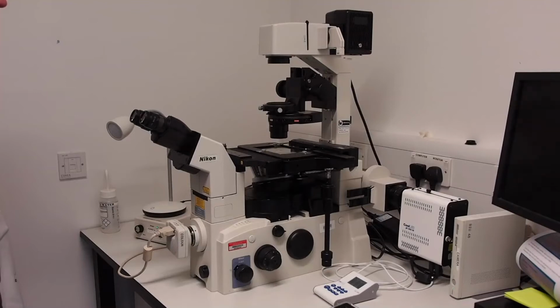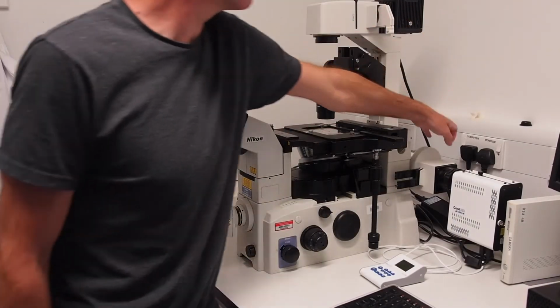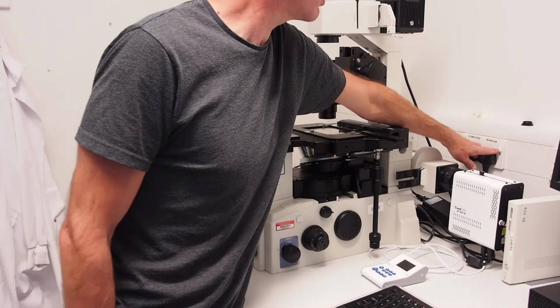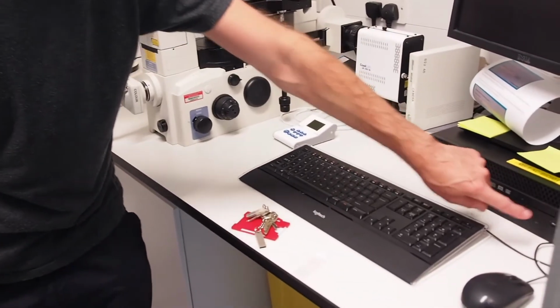In order to turn on the Nikon TE2000 microscope system, firstly turn on all of the components using the switches on the wall for the system, along with the computer and monitor. Turn on the PC and allow it to boot up.